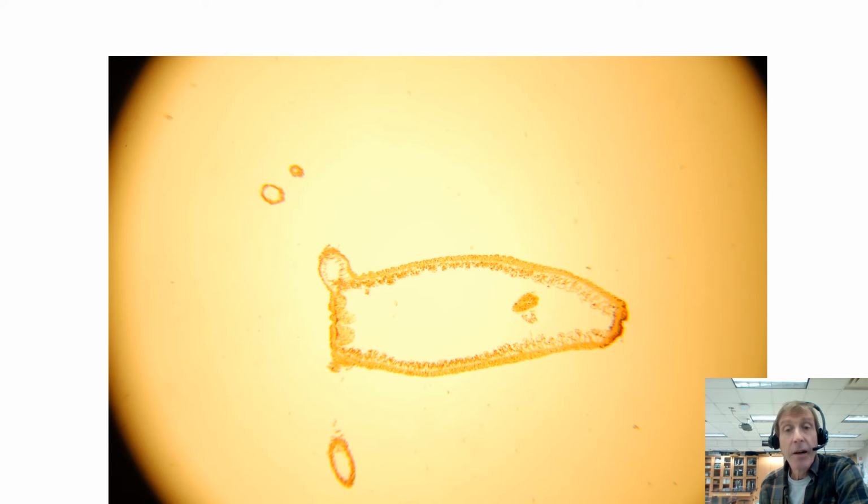All right, this one is phylum Cnidaria. This is actually a hydra, which is in the class Hydrozoa.